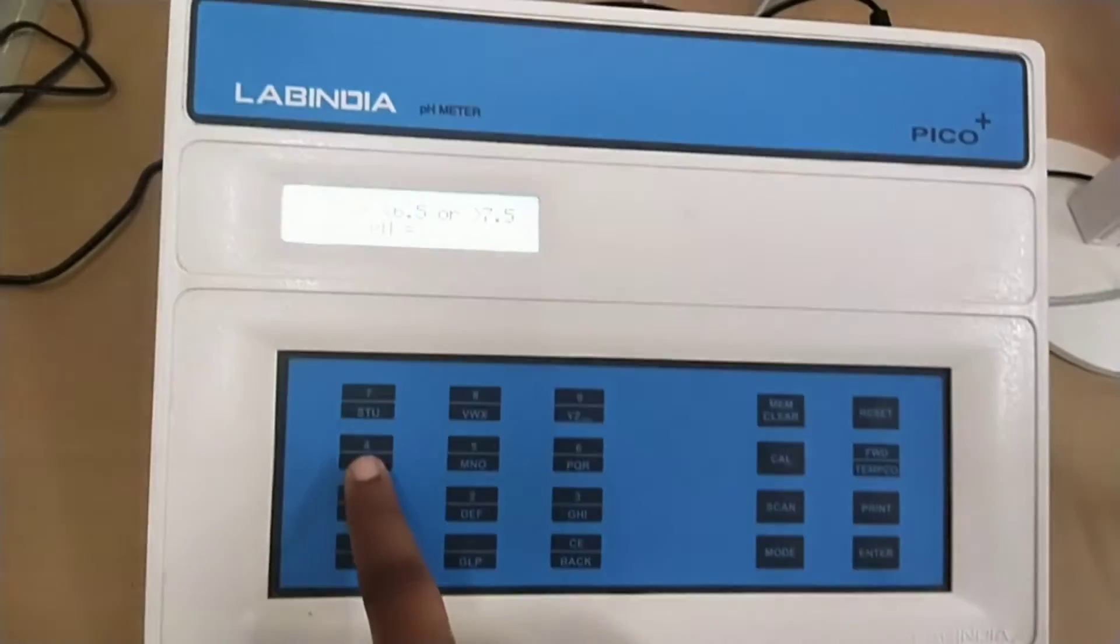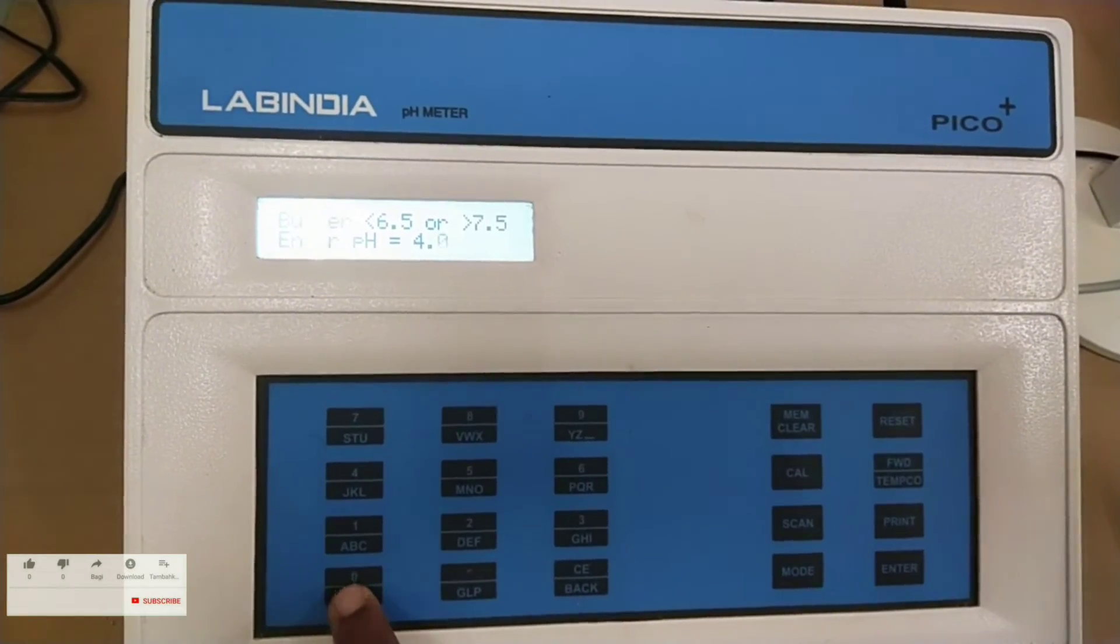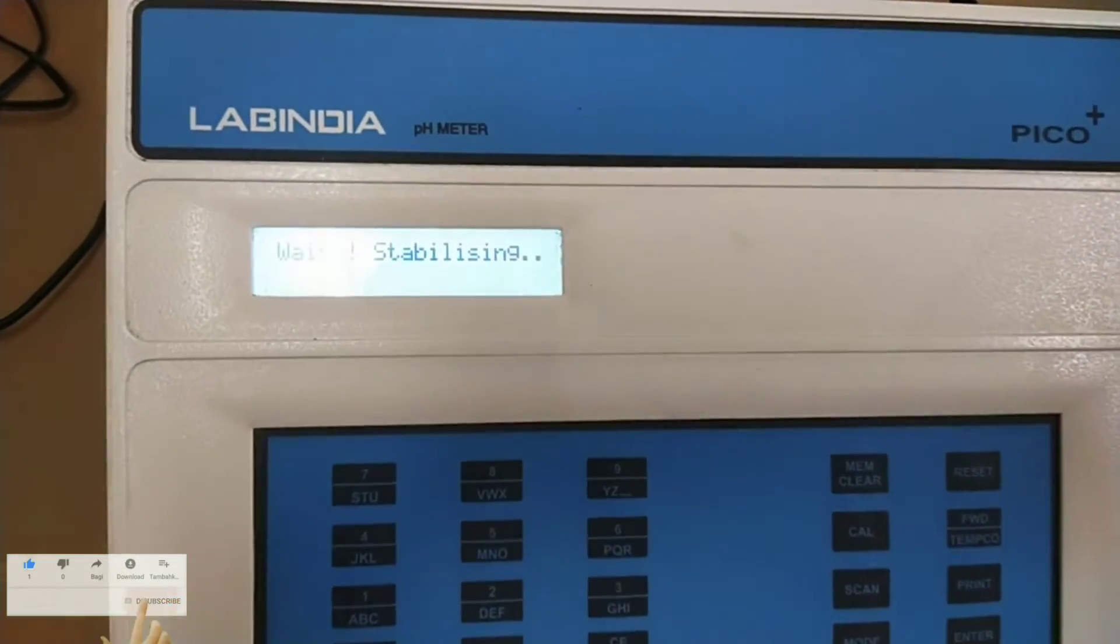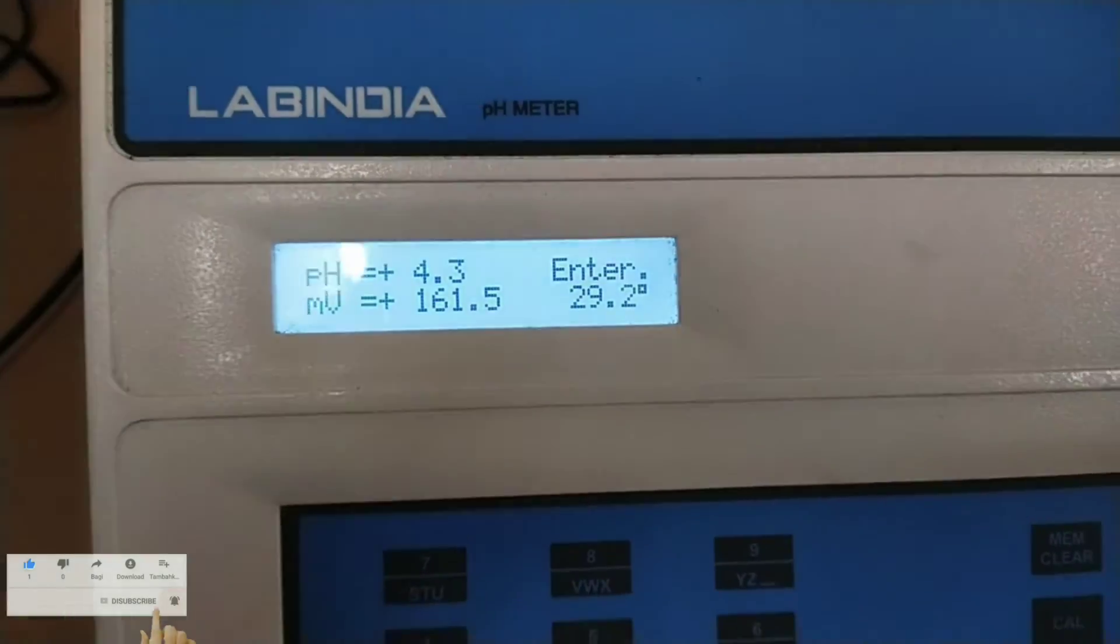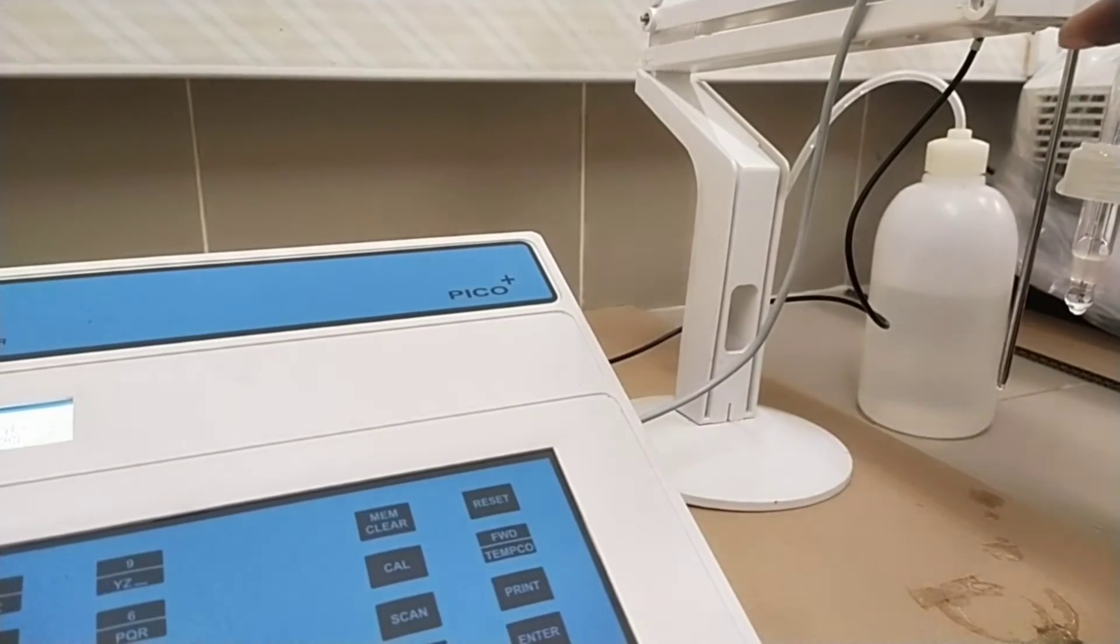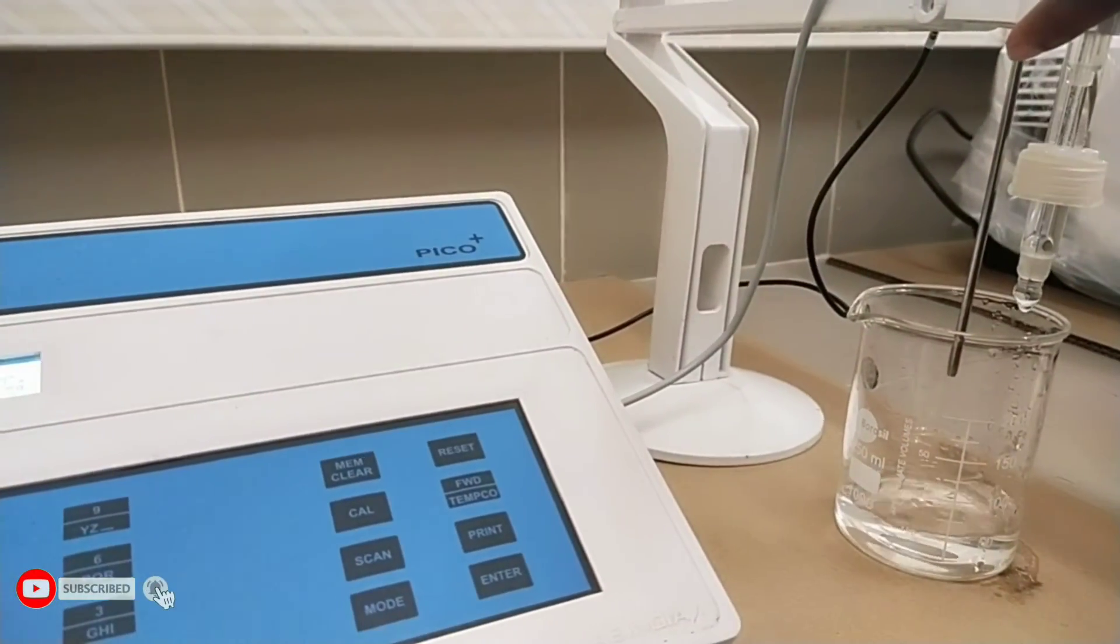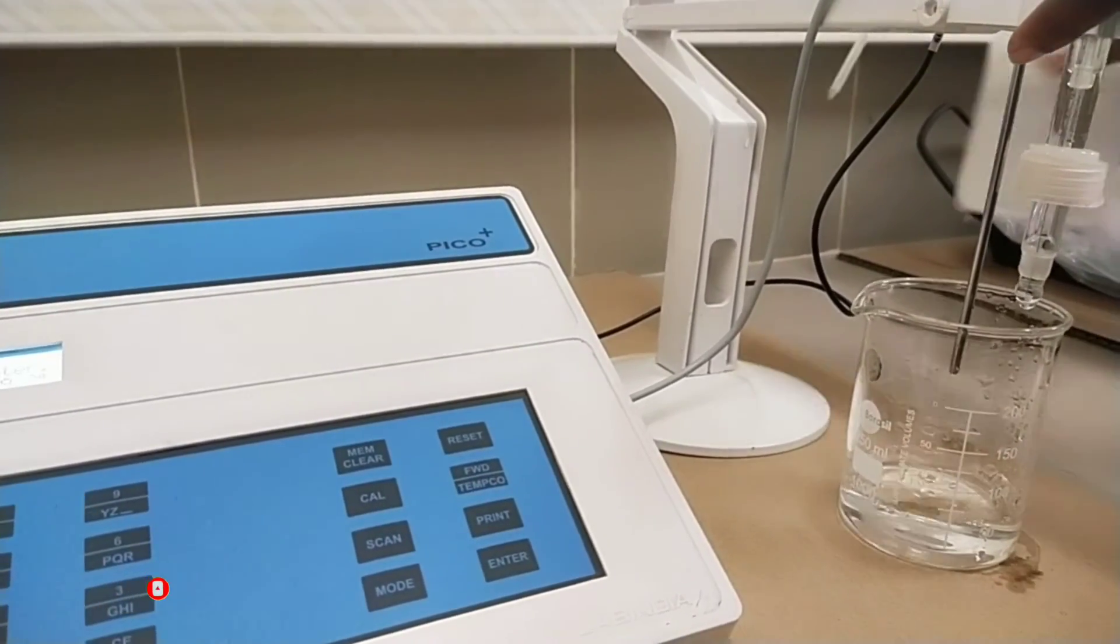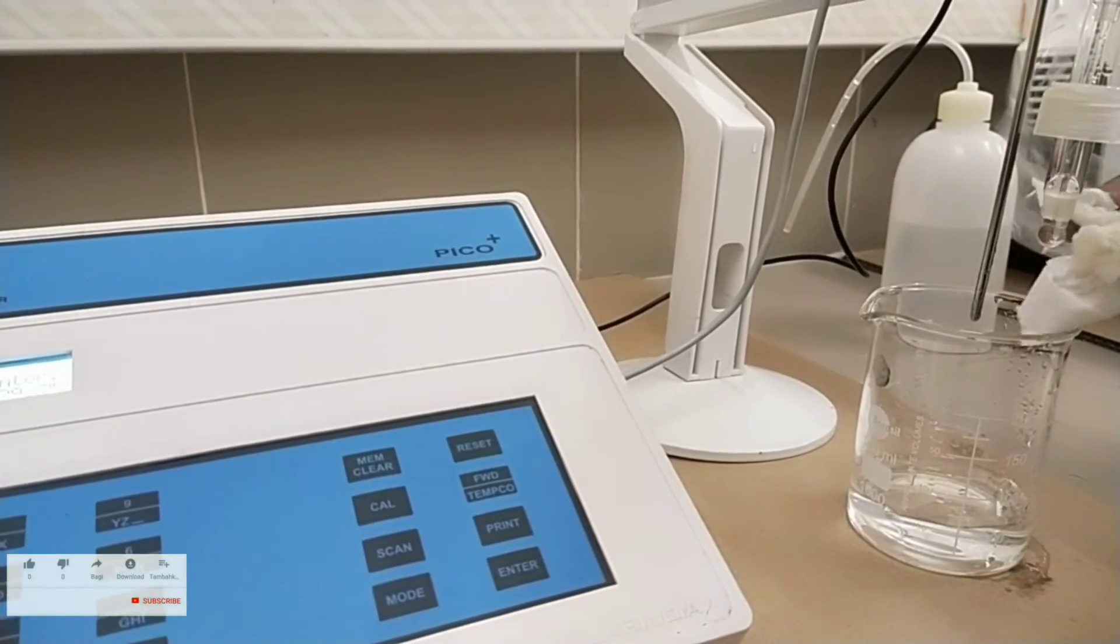Now insert the pH electrode in beaker having pH 4 solution. Enter the value of acid buffer that is pH 4.00. Now press enter key. It display the reading. Now remove the pH electrode from pH 4 solution beaker. Rinse the pH electrode with distilled water. Remove the excess water with tissue paper. Now insert the pH electrode in beaker having pH 9 solution.